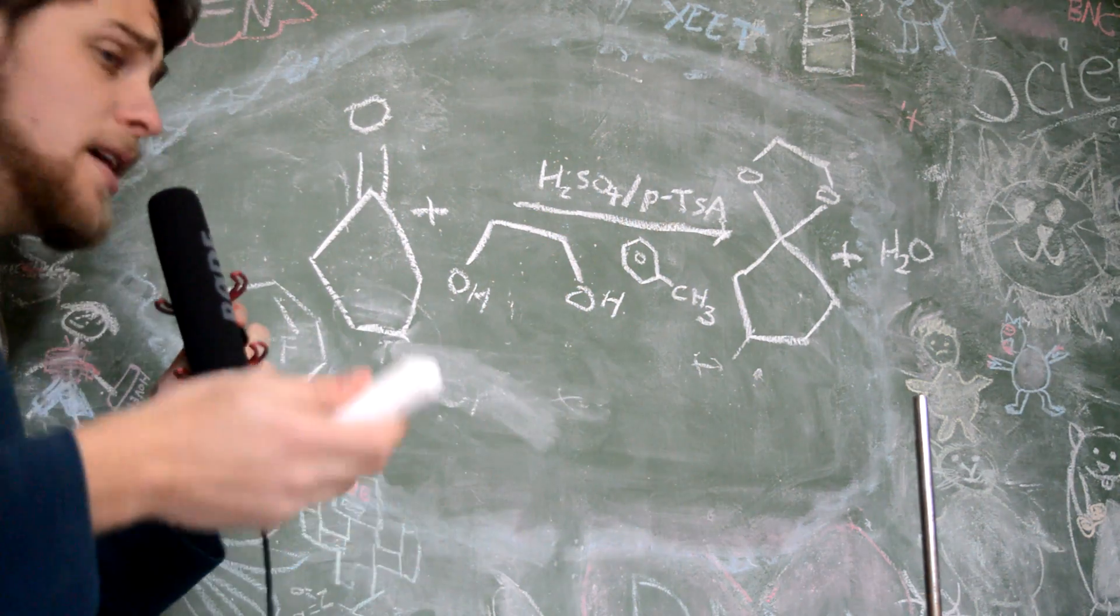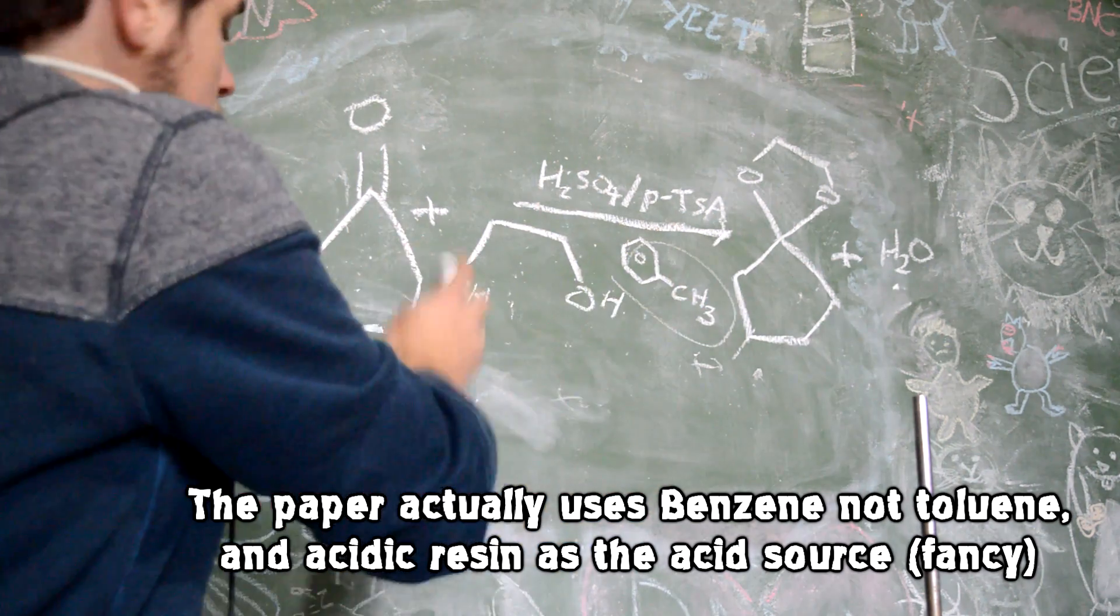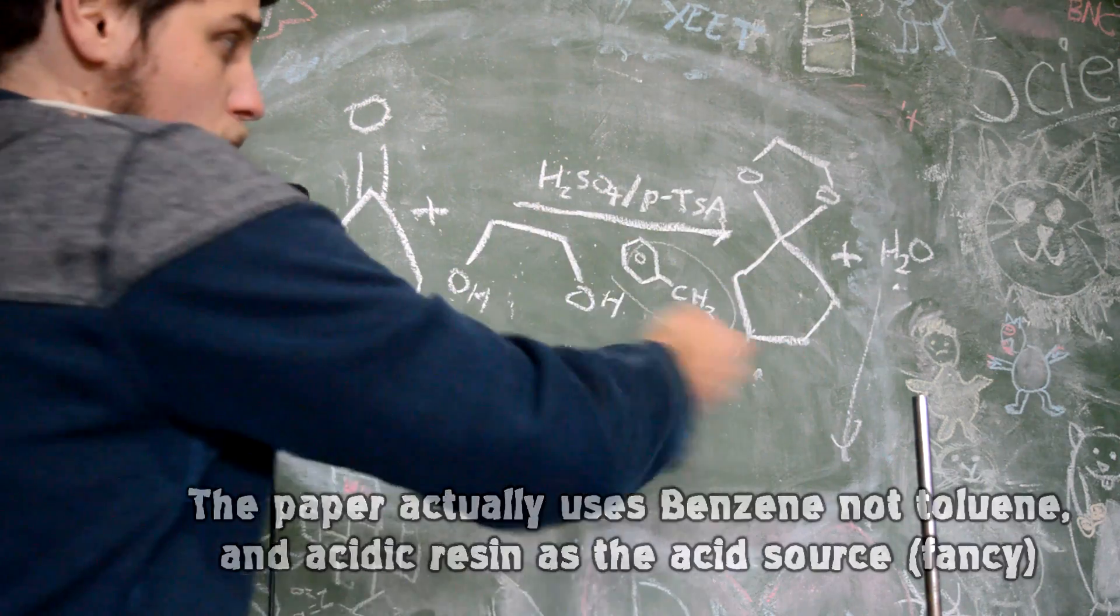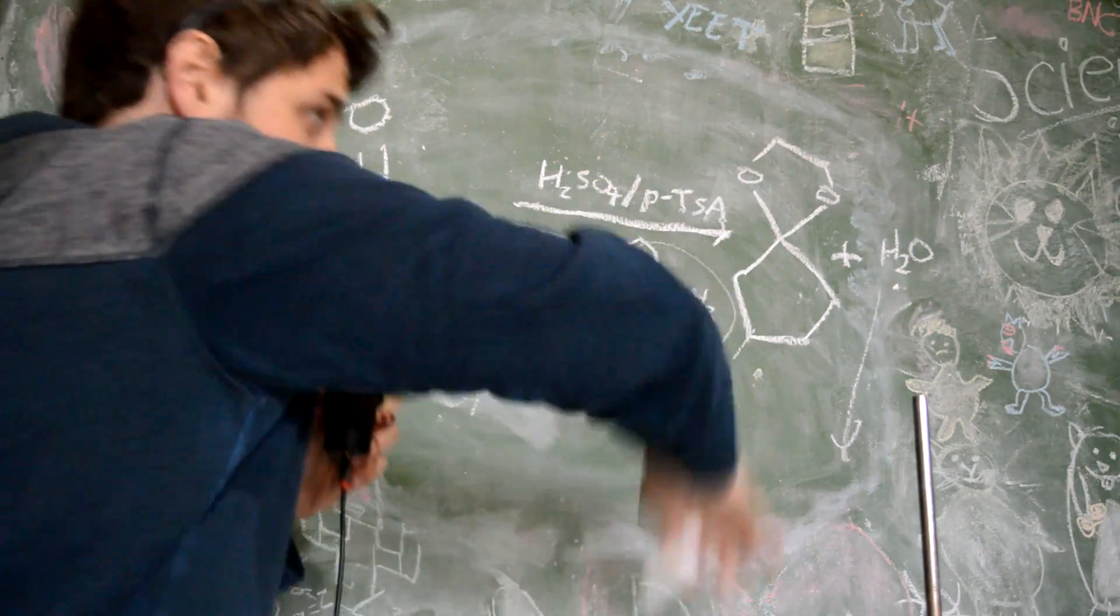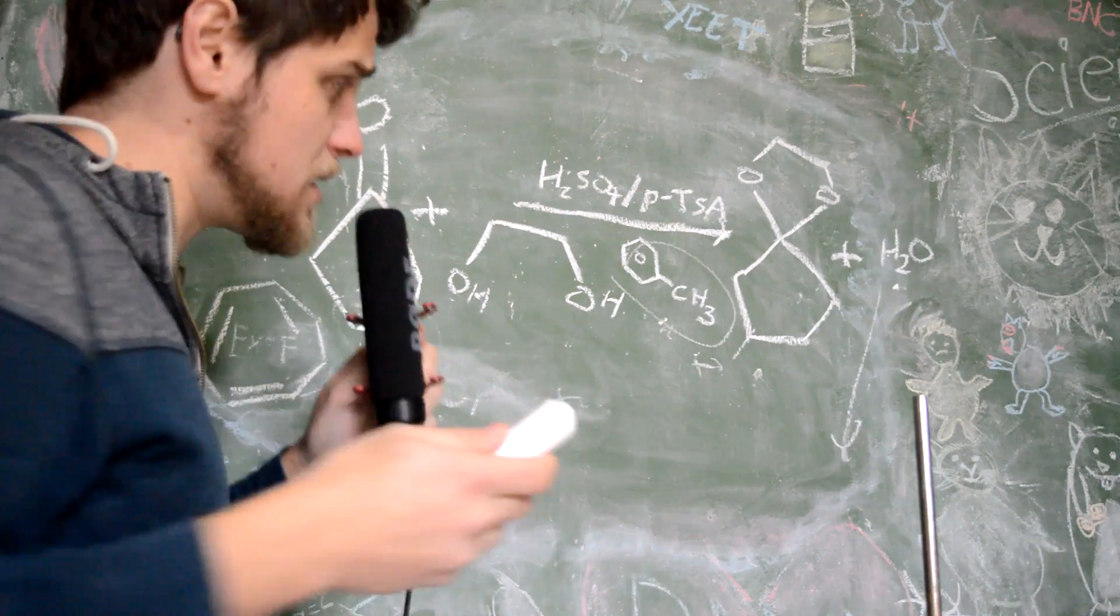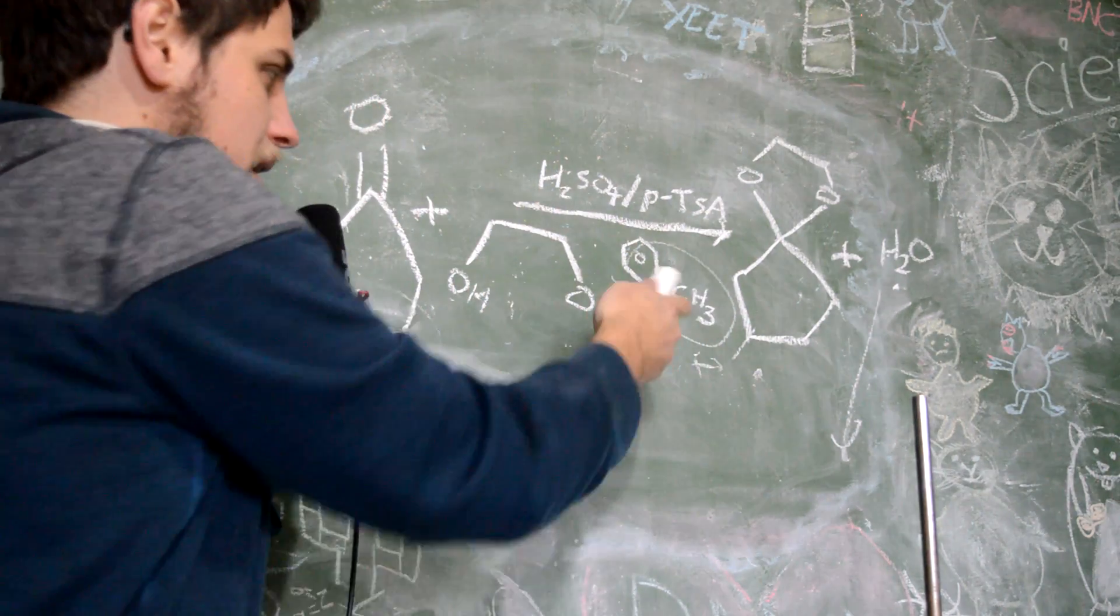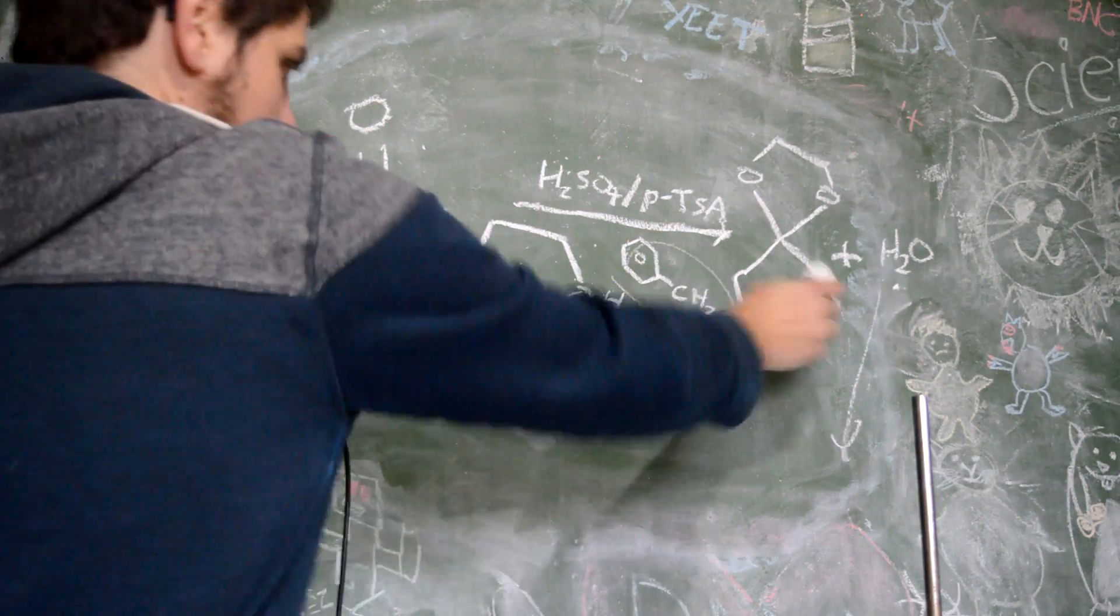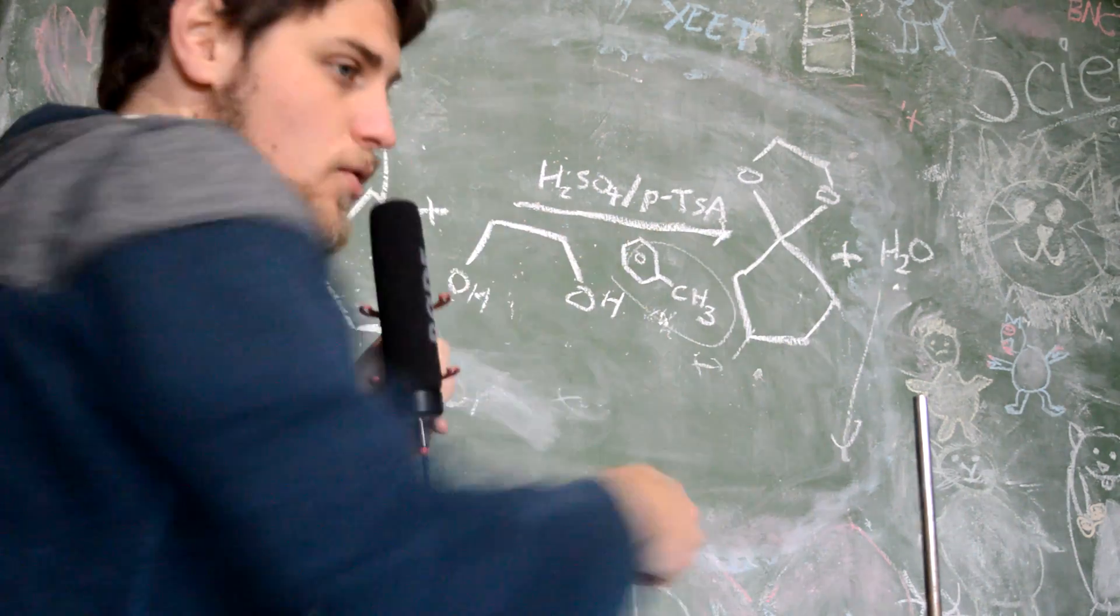A lot of you organic chemistry wizards will be familiar with these reaction conditions. We're using toluene because we're forming water in this reaction, and we need some way of driving this reaction forward. We need to remove water continuously so the reaction will keep going forward. Toluene is very useful because it has an azeotrope with water - it's going to boil in the presence of water at a lower temperature. So that water is going to come over with the toluene as we boil it, pulled out azeotropically. Then we're going to collect it in a Dean-Stark.